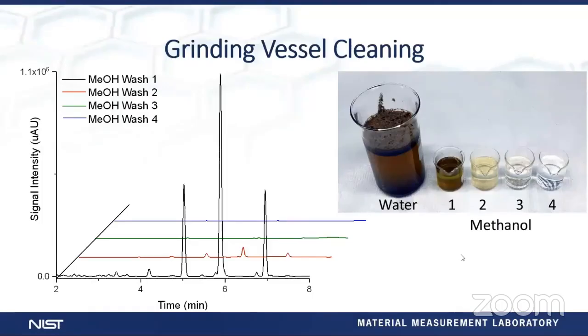And you should do something similar in your laboratory to ensure that your process is going to be adequate for cleaning the vessel. You can do it once, similar to what we did here, and then that should account for all of your analyses, to prevent redoing the same thing over and over again.